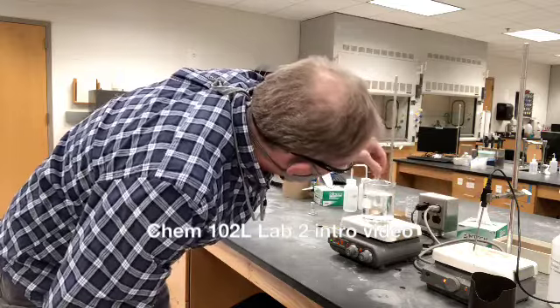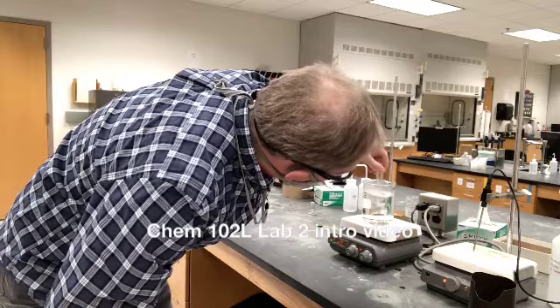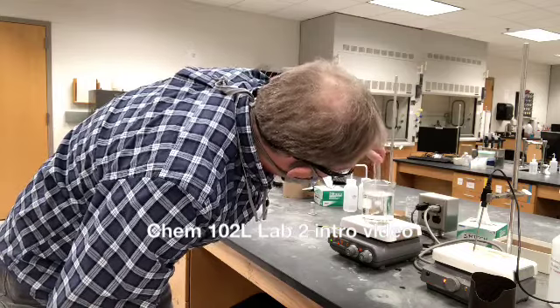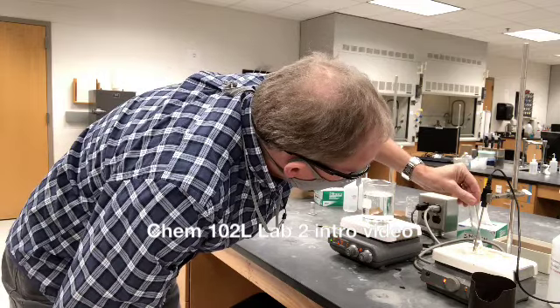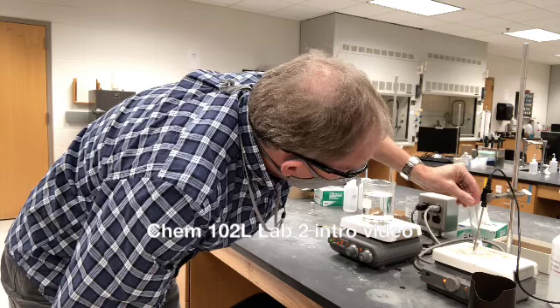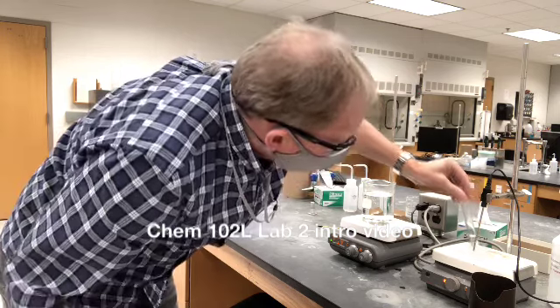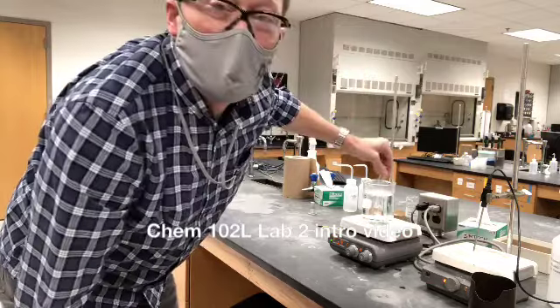I'm going to warm it just a little bit more. A few particles, it's being a little bit stubborn, and we just have to heat it a little bit more.